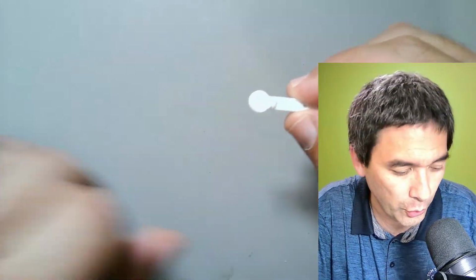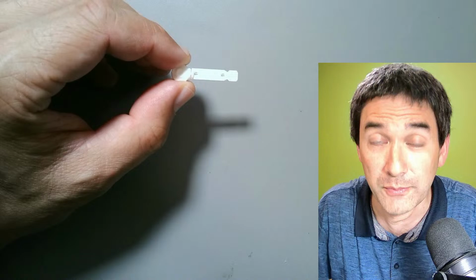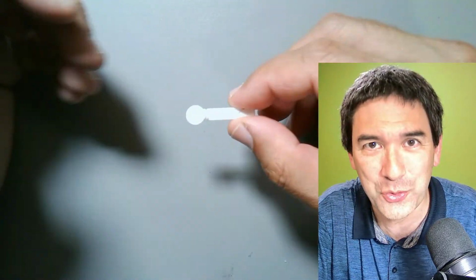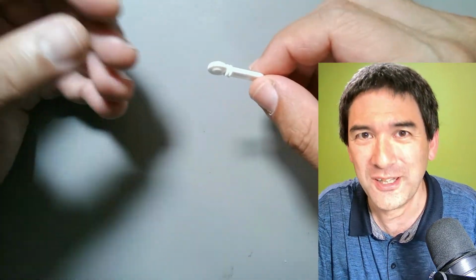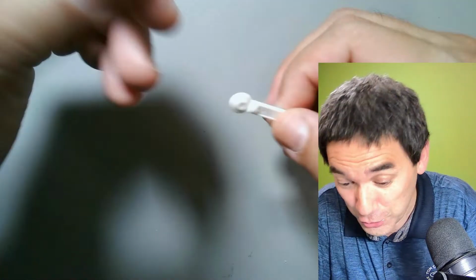Because I want to show you how this actually looks. As a matter of fact, fresh blood looks much nicer and more interesting than what I just showed you. And this is also one of the reasons why I showed you those permanent slides, so that you're able to see a difference between the permanent slides and the fresh blood, so to say.